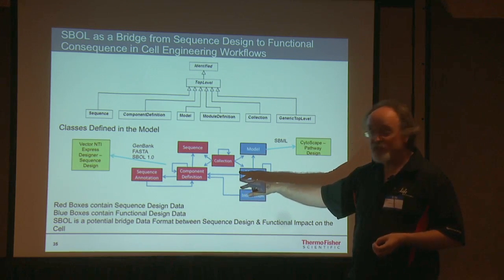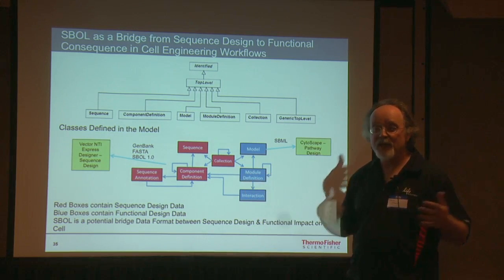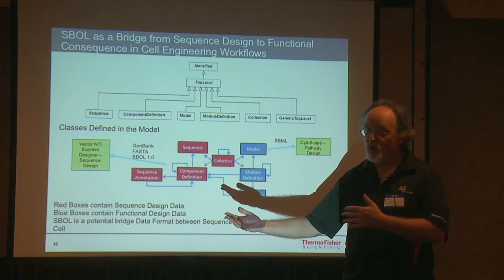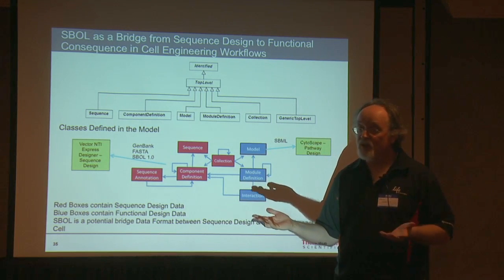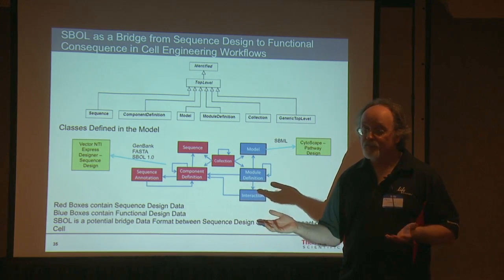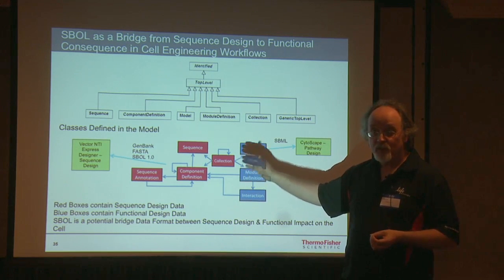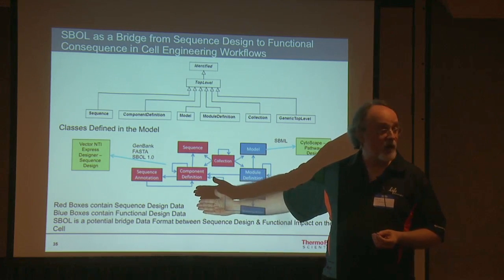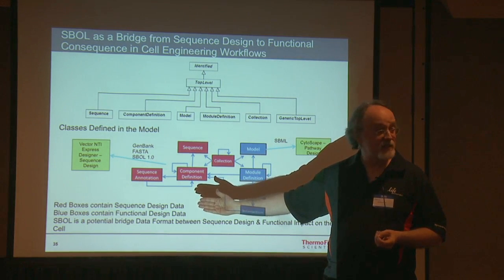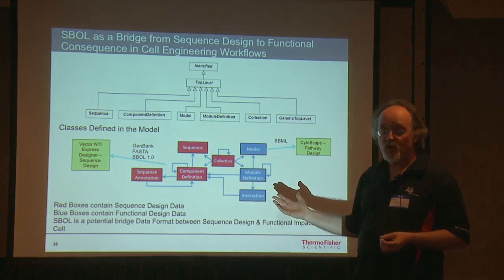What if you basically had a way of also doing this with your own protocols or materials, and you had a way of being able to compare this protocol versus that protocol, particularly when you're starting to go in and engineer cells or doing some kind of a complex workflow, and be able to have the advantage to be able to carry within a data model, perhaps pointing towards another standard for assays or another standard for long lists of assemblies in standardized backgrounds. What if you had a way of being able to build these models?